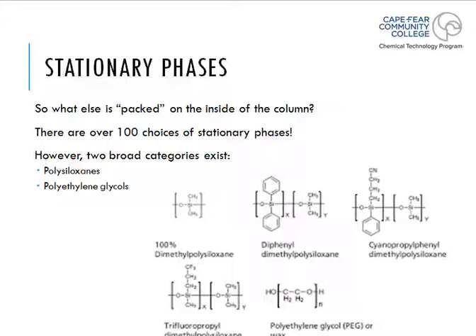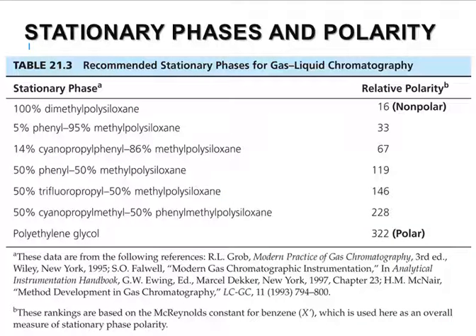So here is my cyanopropyl on top, and then my phenyl is the same as my phenyl here. It's a ring. So sometimes I can get stationary phases that are made up of 14% of that cyanopropylphenyl and then 86% of my methyl polysiloxane. So these are just a couple of different choices that I could maybe order as far as a capillary column goes.